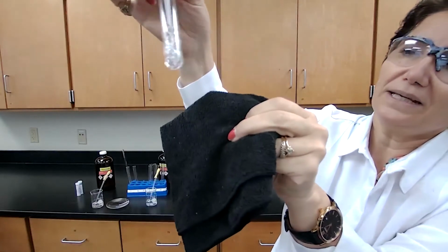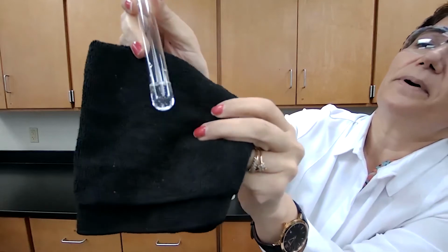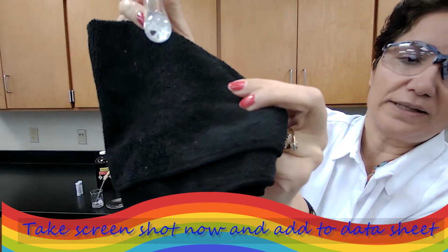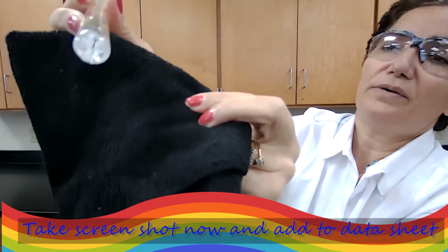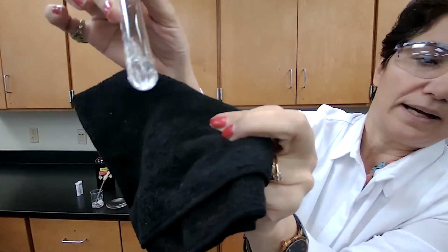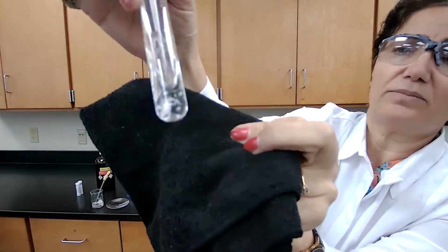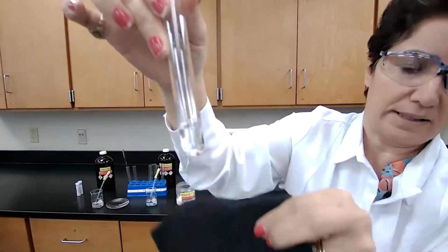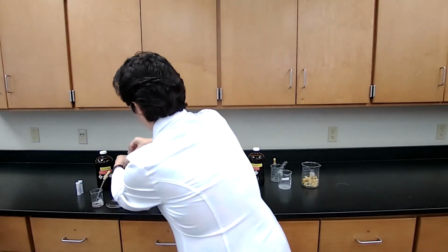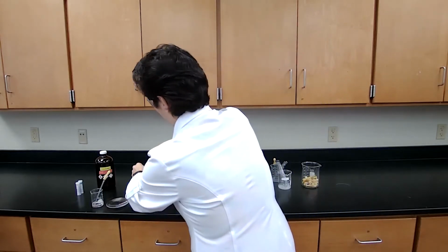And I'm going to shake it vigorously and see that the particles are still settled down at the bottom of the test tube. So it did not dissolve. So it would be counting as insoluble, okay? Insoluble. And when I'm shaking, you could see that the particles are moving also in the liquid, insoluble. It did not dissolve. So I'm going to take these 3 test tubes out and my next solvent.